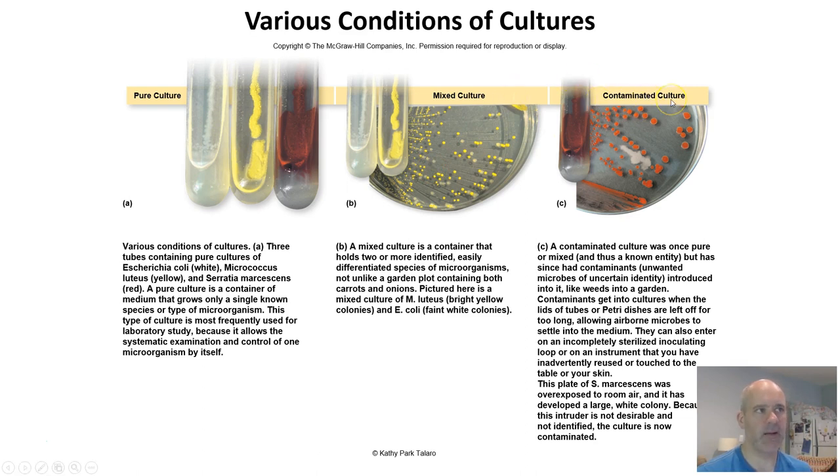And then what's a contaminated culture? So a contaminated culture is one where you have an organism in the culture that you don't want to be in there. So like on this petri dish you see here, lots of red colonies and red streaks over here. That was almost certainly the organism that was supposed to have been grown on this agar plate, but we see some white growth in there as well. So that's some sort of unwanted contaminant that got into the culture, perhaps from using poor technique in the laboratory when setting up the culture. So you want to pay very close attention to that on the aseptic technique Learn Smart Labs activity. Or it might have come in from the air when the culture was being set up. That's also part of using good aseptic technique. So we would call that a contaminated culture.